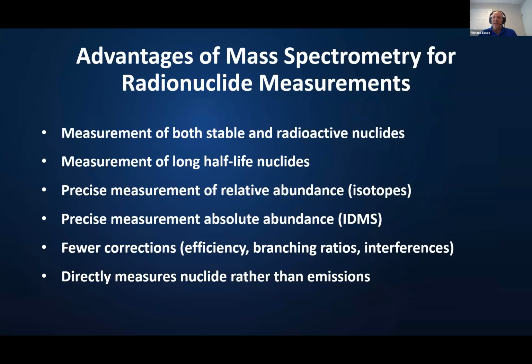So, as I said, my hope is, and Lisa and Jason will have to keep their eyes open because I can't necessarily see hands up or anything like that, but I just want to foment some discussion here as to what can typically be done with multi-collector isotope ratio mass spectrometry, but also something we've heard a fair amount about today, using quadrupole and high precision ICP-MS for getting elemental concentration values as well, which I think are both important.